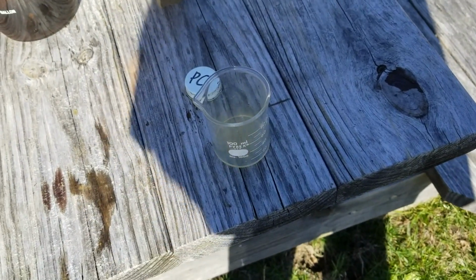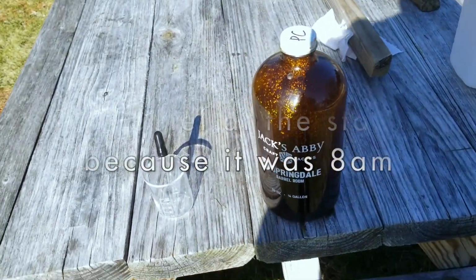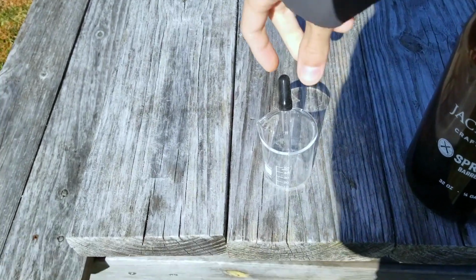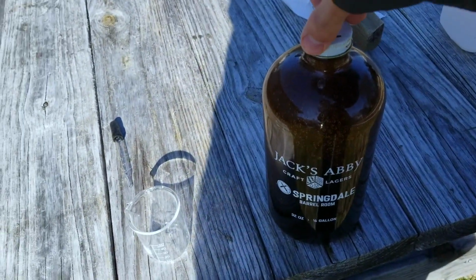Those are nitrogen dioxide fumes. Hey everyone, today this is going to be a quick video. I just want to use all of this fuming nitric acid that's in here today because I honestly hate this chemical and I hate having it around and I just want to get rid of it.